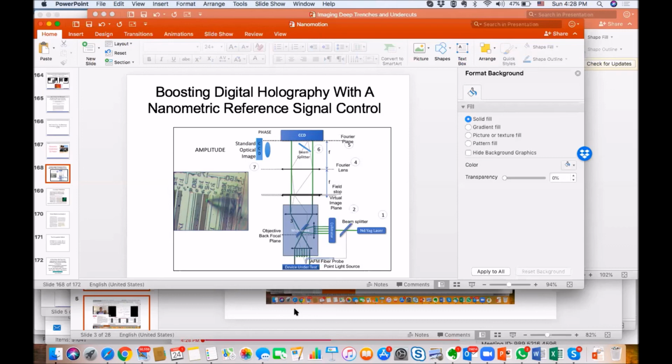And as I showed you, your stages are being used in structured illumination, and I think they should be able to be used even more in that field. And if you integrate with an AFM company, obviously I would be very happy to integrate with you. But there are others other than Nanonics, and you can certainly make a huge contribution with your technologies in AFM over large ranges.